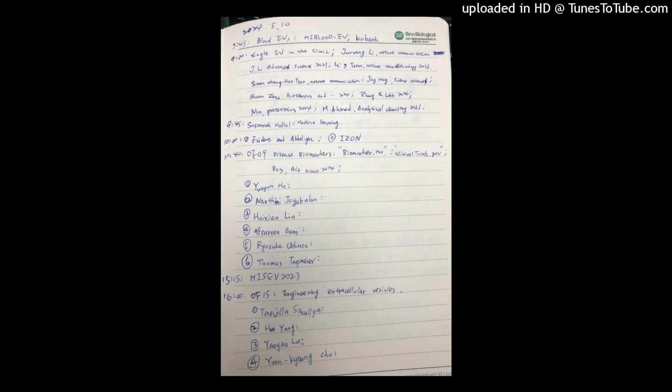And just because Marlene had mentioned the AUC curves and true and false positives and these kind of calculations, we went ahead and did these calculations anyway based on the Western blotting data, and you get a certain sensitivity and specificity. And the challenge is now to translate that into the capillary Western blotting system, protein simple, because that uses a lot less protein. There's only 10 micrograms for normal Western blot. You can get away with 0.5 or something, a lot less. And if you remember the cutoff we had at the beginning between the different methods, if we could use this system, it would mean we can probably afford to look at more pure preparations in the future.